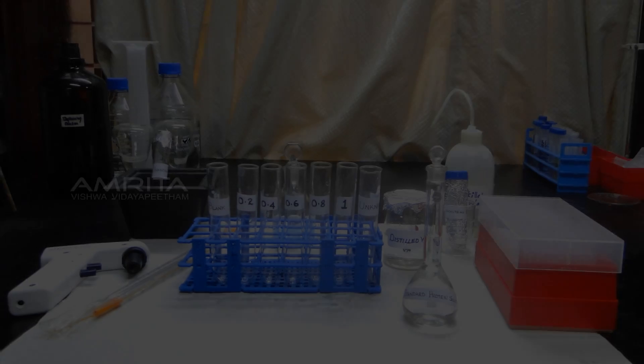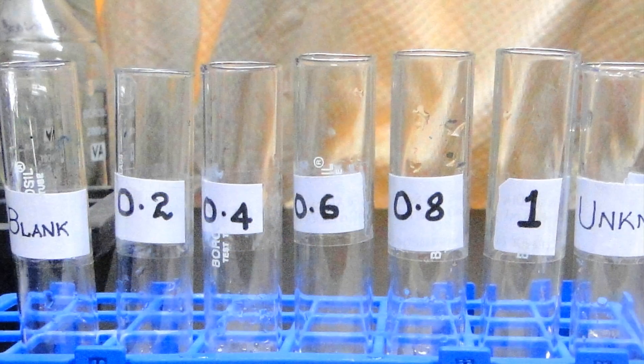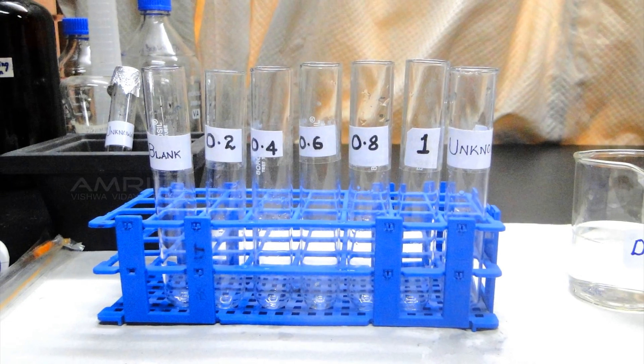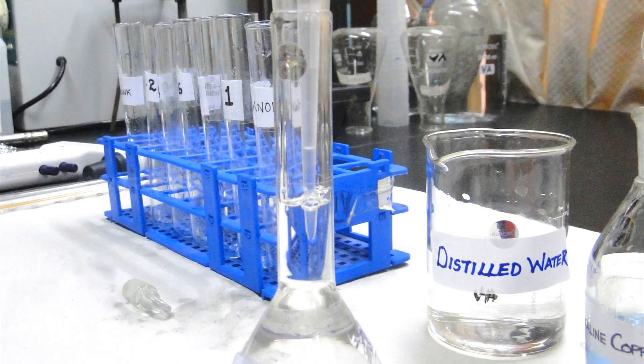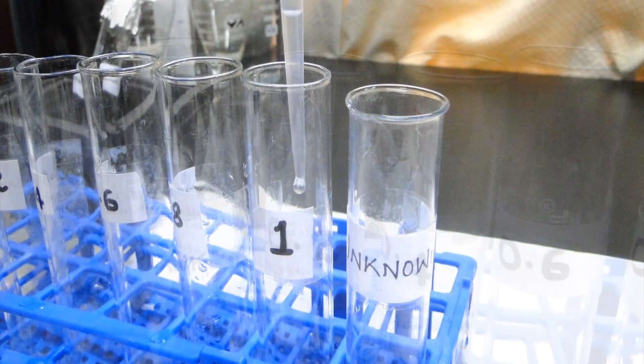Procedure: Arrange the reagent solutions prepared on the table. Label the test tubes with the volume taken and arrange them in a test tube rack. Pipette out the standard protein solution from the standard flask into the test tubes labeled 0.2ml to 1ml.